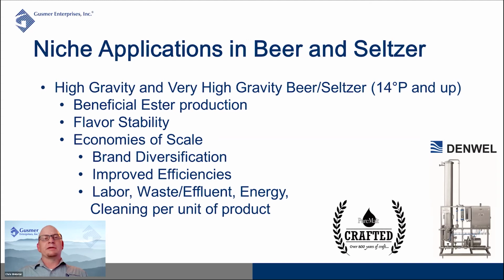By optimizing your fermentations with ORP, you can improve your yeast health so that they aren't so stressed out. By improving that yeast health, you can get more beneficial characters. We've all probably tried, or some people on this call have probably tried, to brew a high gravity beer at some point, and like many, we've all experienced a stuck or sluggish fermentation.